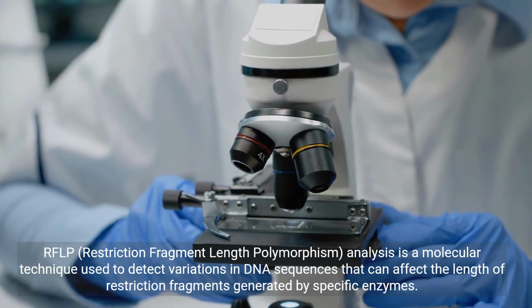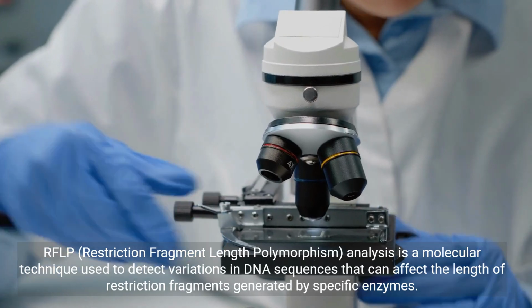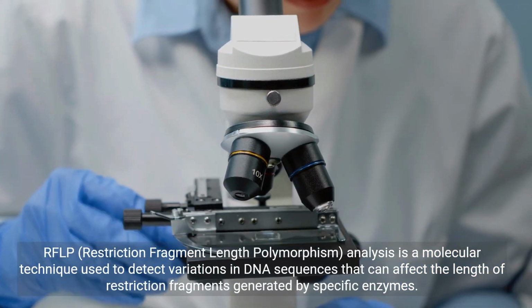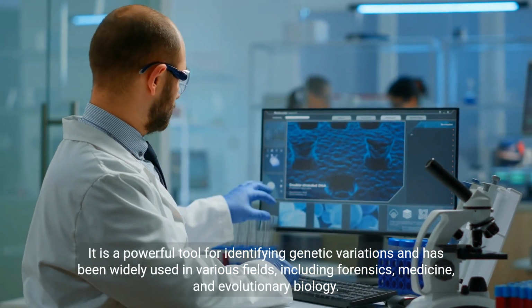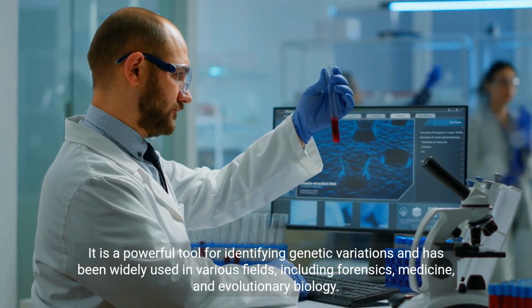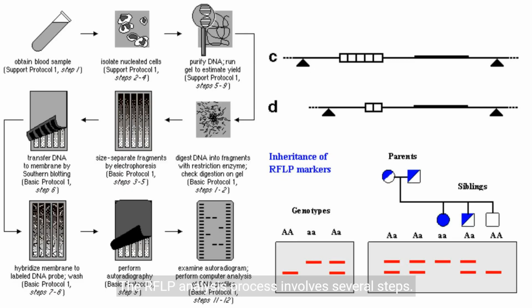RFLP, restriction fragment length polymorphism, analysis is a molecular technique used to detect variations in DNA sequences that can affect the length of restriction fragments generated by specific enzymes. It is a powerful tool for identifying genetic variations and has been widely used in various fields, including forensics, medicine, and evolutionary biology. The RFLP analysis process involves several steps.